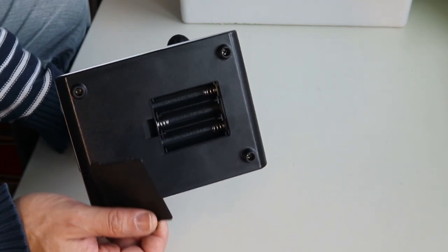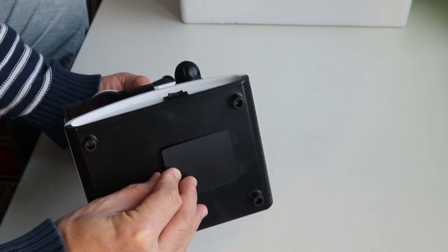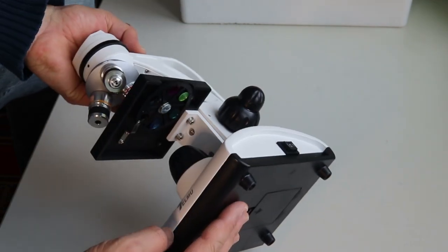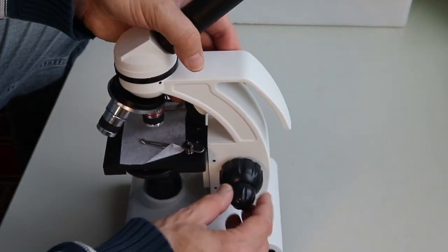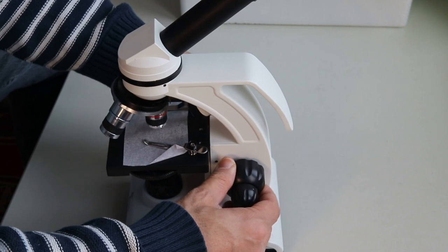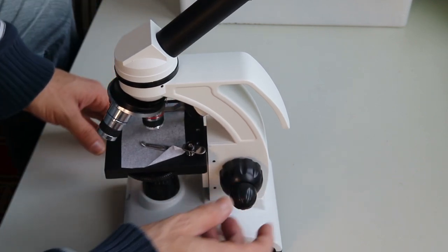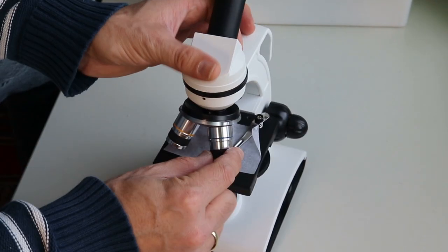So three double A batteries fit in here. There is no connector for an external power supply. And it has two focusing knobs, of course, and a fine focusing knob here. Okay, so the objectives, I do not know how good they are.